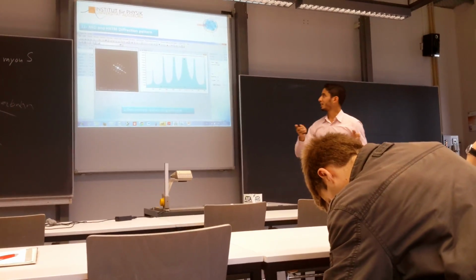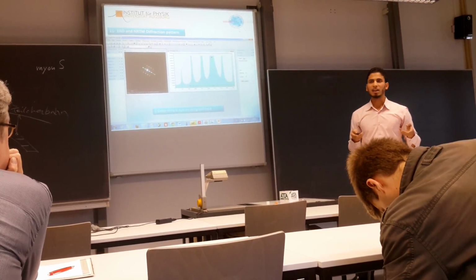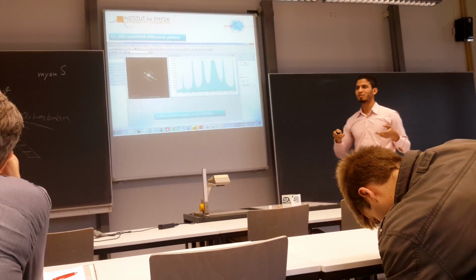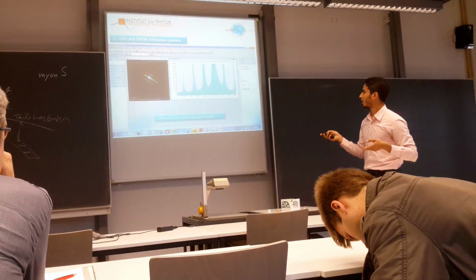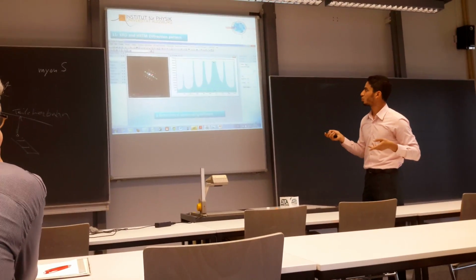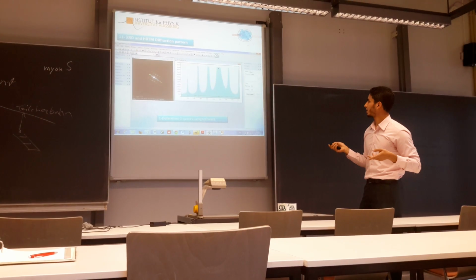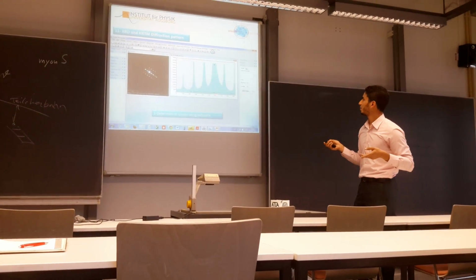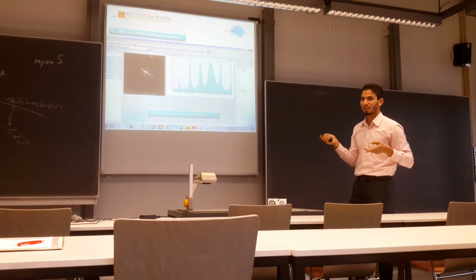Now, XRD and high resolution diffraction pattern. In order to publish papers, it's required now for prestigious journals to do this, and I'm doing this in my paper now. First of all, you should determine the spacings between the pattern by using computer software, by measuring and giving this value and dividing by 1, 2, 3, 4. As you increase, you will get more precise measurements.